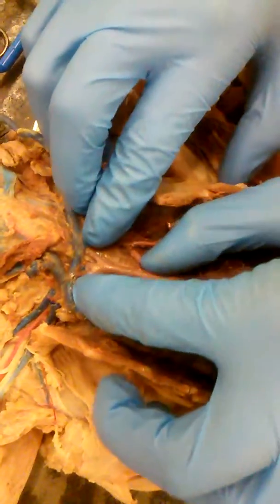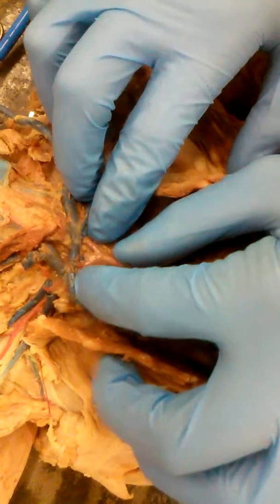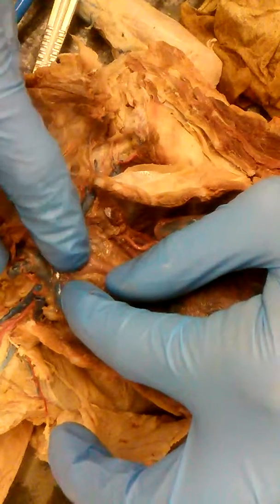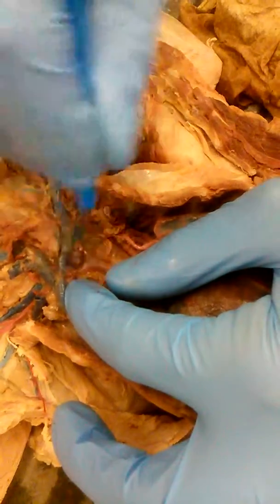So, off of the brachiocephalic right here, you can see there's 3 branches. This first one is the left common carotid. That middle one is the right common carotid artery. And then this one right here is the right subclavian. So they're all right? Yeah.